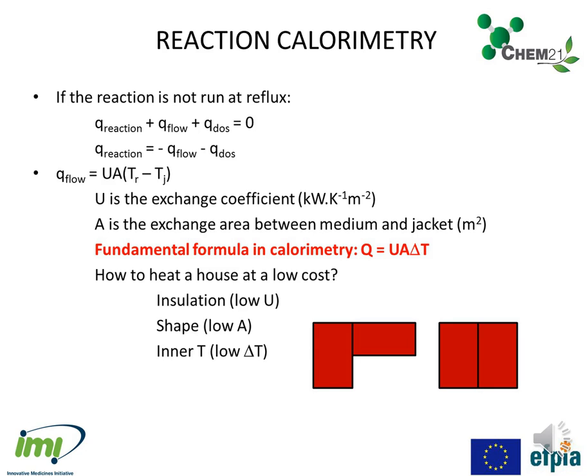Thirdly, do not heat at 25 degrees. 19 degrees inside is sufficient.